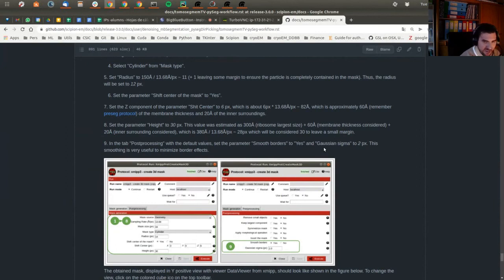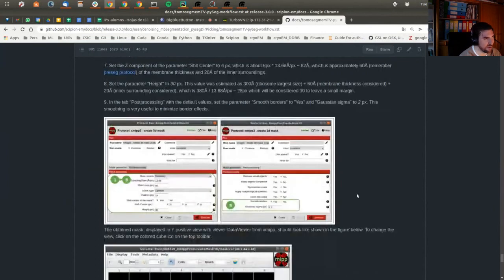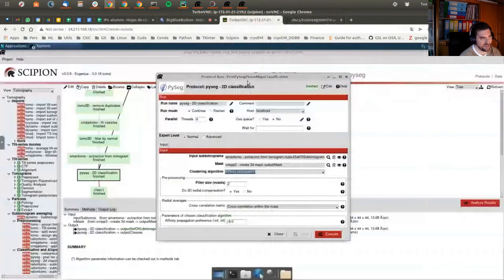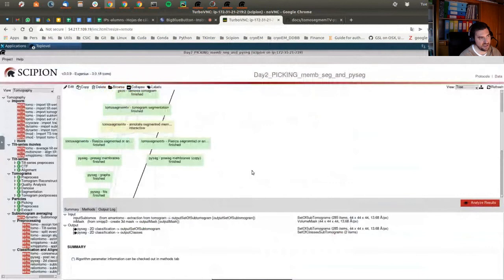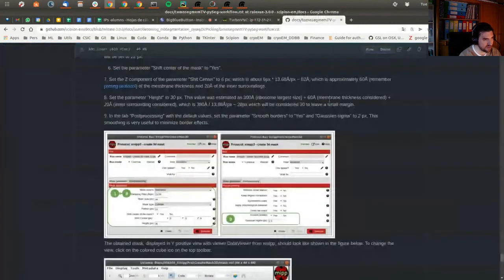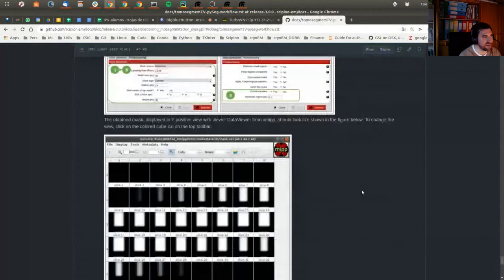Thanks, Dimitri. Just very fast before all the people leave. At this point, we need a mask to determine the region of interest. It can be very easily created with XMIPP3. It is quite well explained again in the documentation.